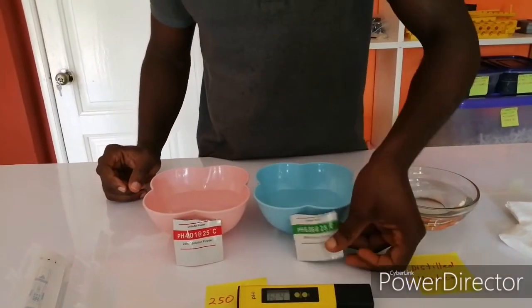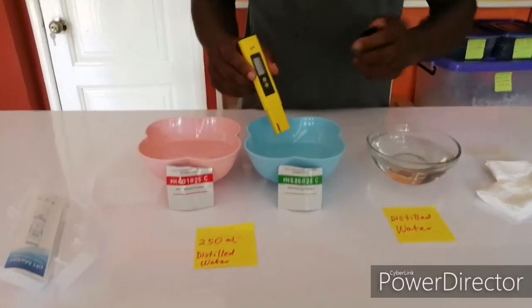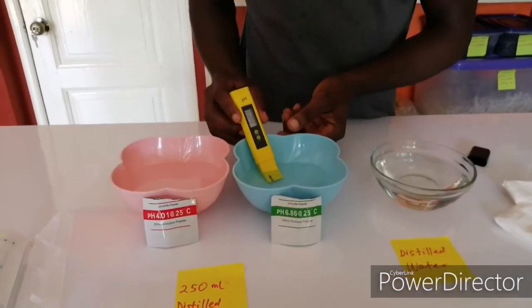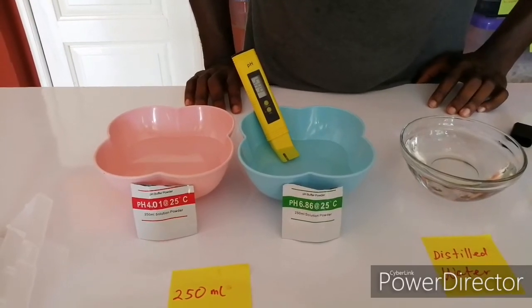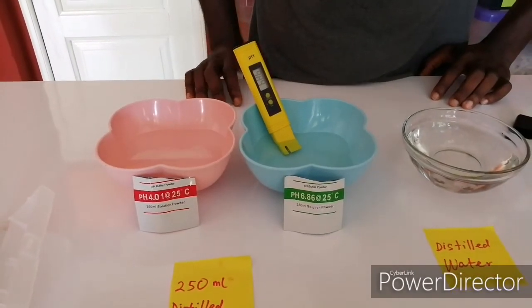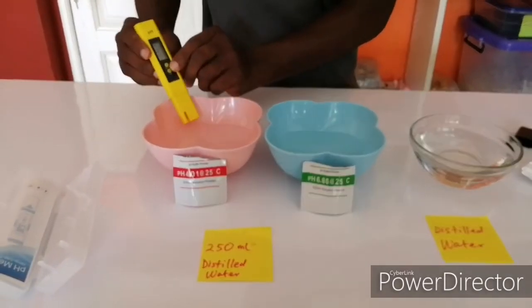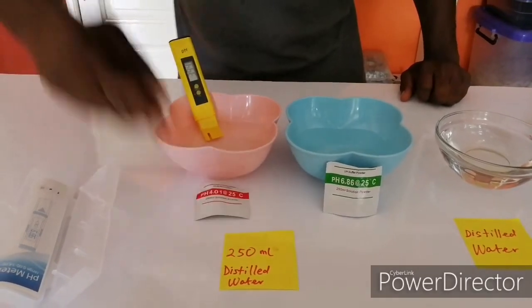Now if you want to test if your calibration was successful: if you dip it in the 6.86 solution, you should get that value; if you dip it in the 4.01 solution, you should get that value. I'm going to dip it in — between 30 to 60 seconds you should get a stable value. And there we have it — that's a good calibration. I'm going to rinse it and clean it, and then we should get 4.01.